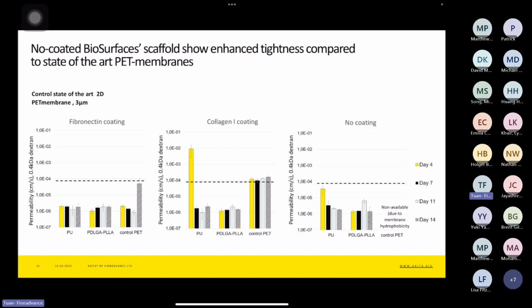And we didn't just stop at the immunostaining. Before that, we were also doing the permeability assay using dextran molecules. Here we have the 0.4 kilodalton dextran molecules passing through the membrane. The way we did that is that we loaded the dextran molecules through the microchannel on the bottom, and then we sampled the media from the top of the membrane. In that way, we can see how much of the dextran molecules can pass through the barriers, or the gut barriers formed by the Caco-2 cells.